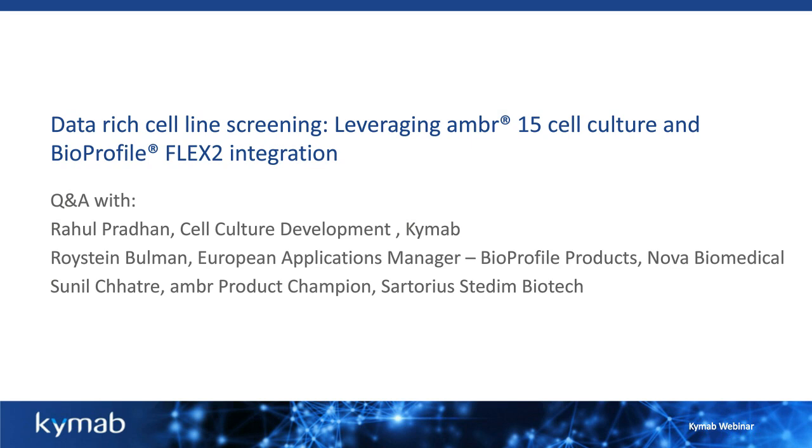I guess I could just make a small point. I can't go into too many details, but these were unique clones. These are monoclonal cell lines, so you would expect them to be slightly different. And even though they would experience the same process within a bioreactor, at a cellular level, each cell line is slightly different. So you would expect them to behave or react differently to the process. So I'm not totally surprised that we saw different profiles between different clones. Thank you very much for that.